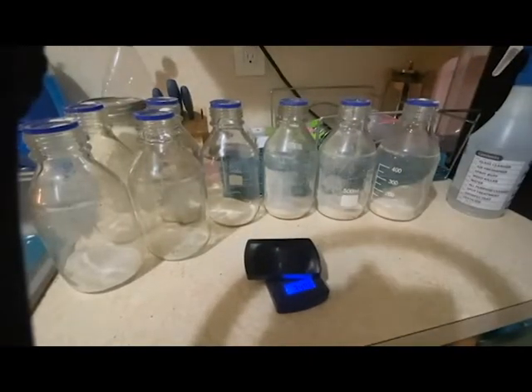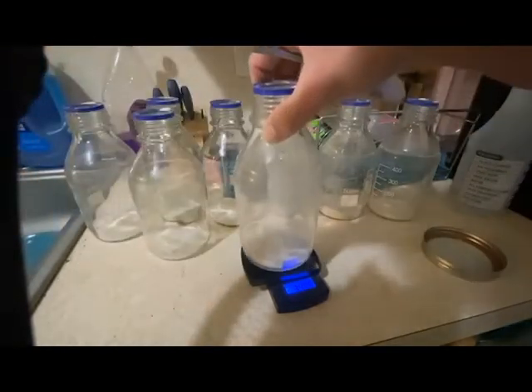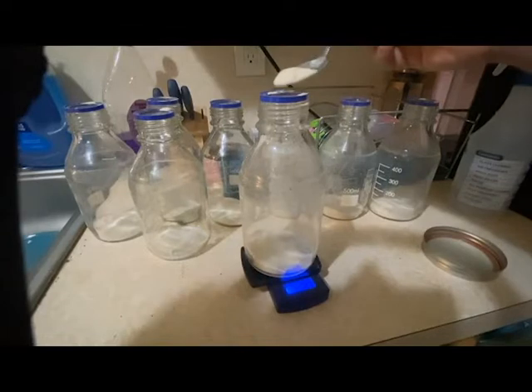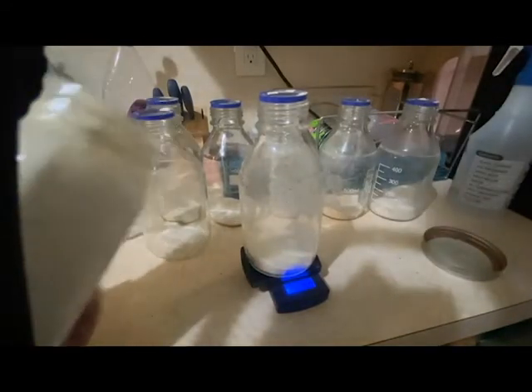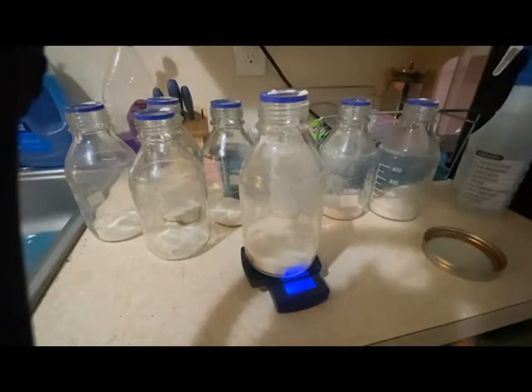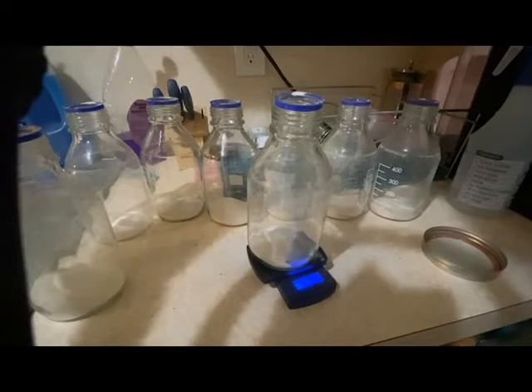So we got all the agar in there. Next up is the malt. Just a heads up, if you've never done this before, if you do get malt extract, it is very absorbent. It will absorb the heck out of the moisture in the air. It likes to cling to things. So when I buy my malt, it usually comes in a bag or a pouch. I always immediately put it in a mason jar and it keeps it dry and fresh. If you have a silica packet or any sort of food grade desiccant, I would advise putting that in there. It'll keep it nice and powdery and fluffy.